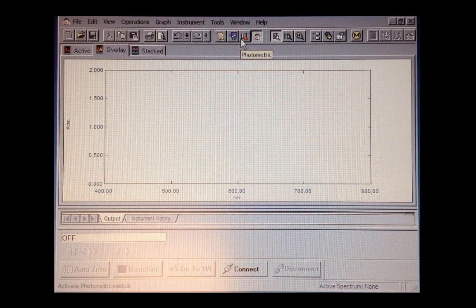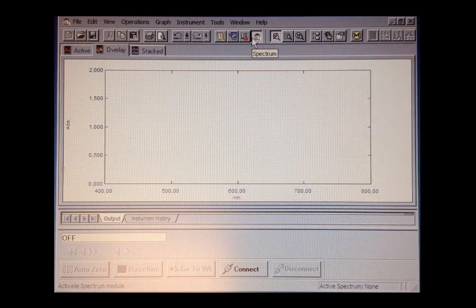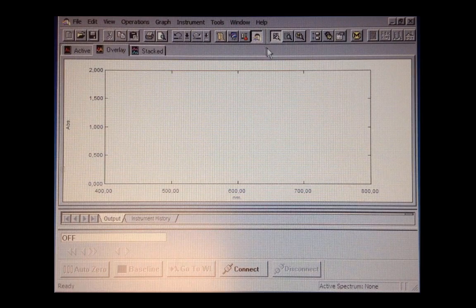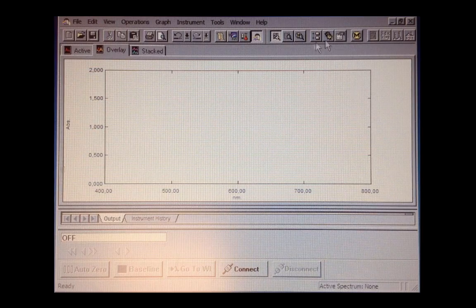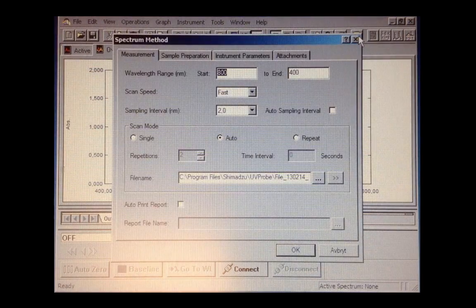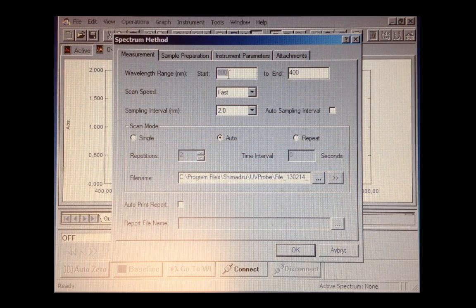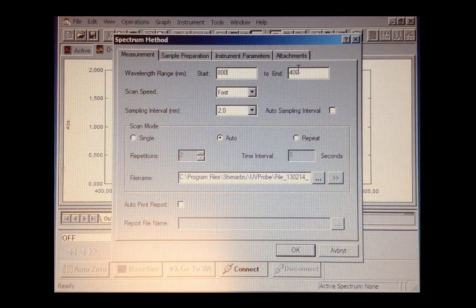You can select kinetics, photometric, and spectrum. The most common use is spectrum. We select this and then click method. Then you need to set up your experiment by changing some parameters.